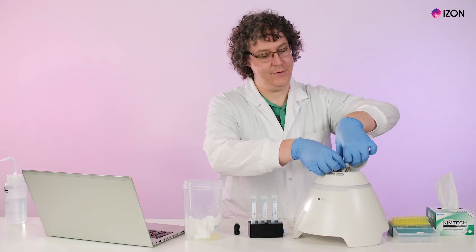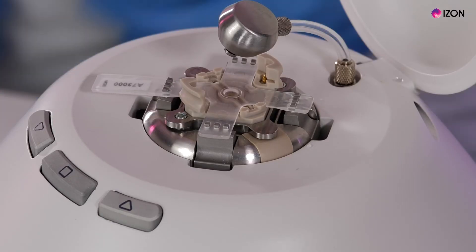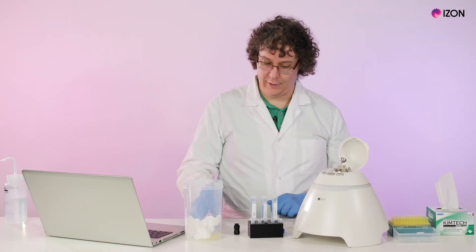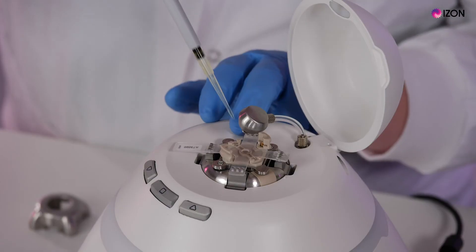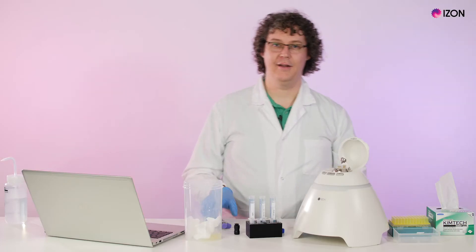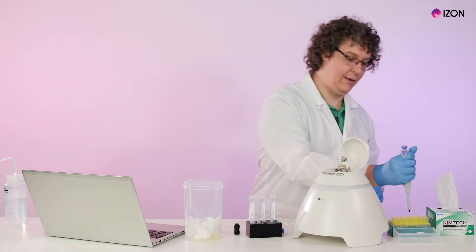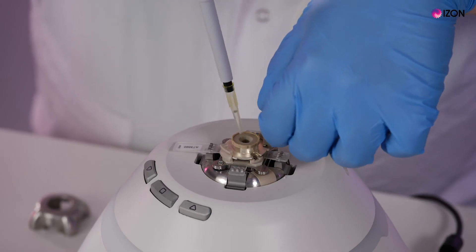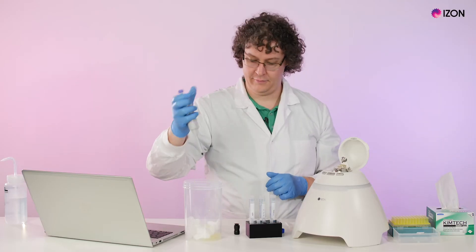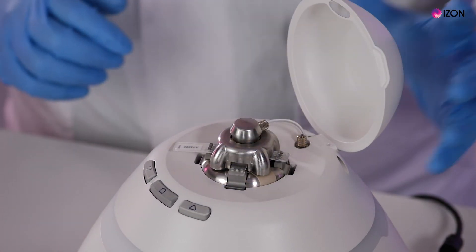Reload the nanopore on the stretcher and load 75 microliters of your measurement electrolyte into the lower fluid cell. Check if there are any bubbles visible under the pore. Attach the upper fluid cell and load 35 microliters of measurement electrolyte into the upper fluid cell. Attach the shielding cap, insert the pressure nozzle, and close the lid.